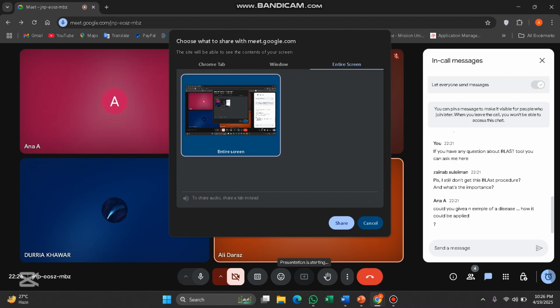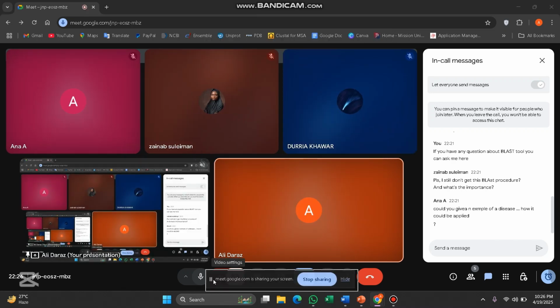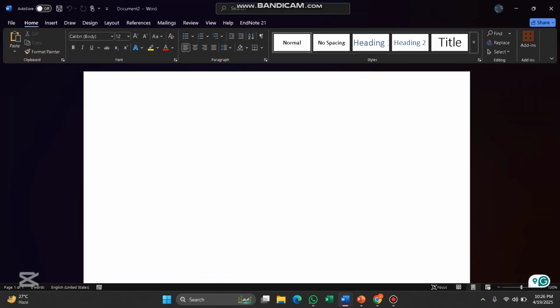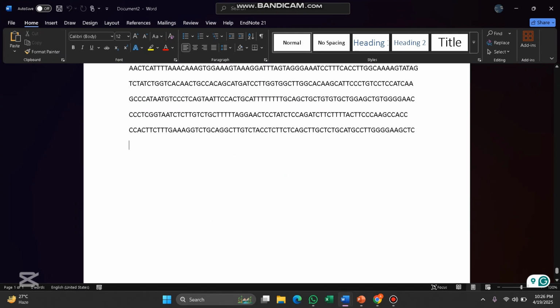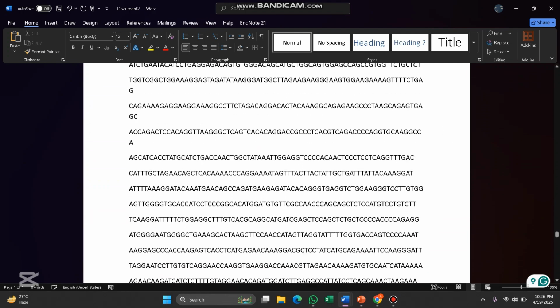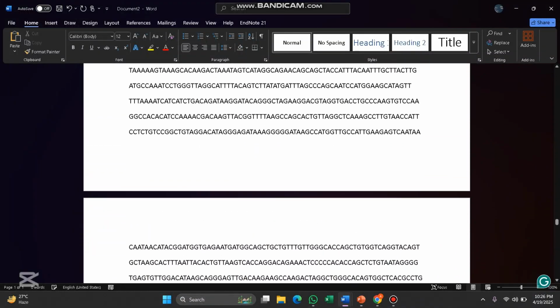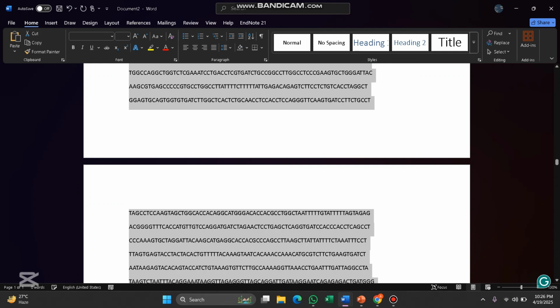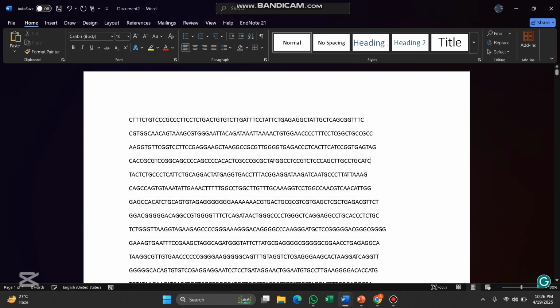For this, I am going to share my screen with all of you. We just open the Word file and paste the sequence here. This is the sequence of BRCA1, and it is the healthy one. And now I am going to mutate this one.